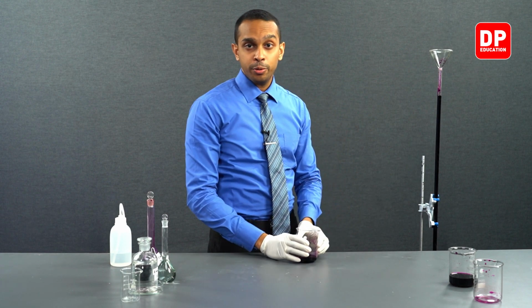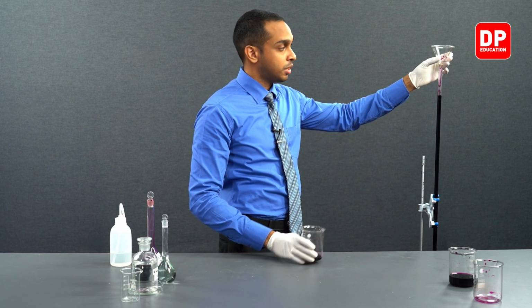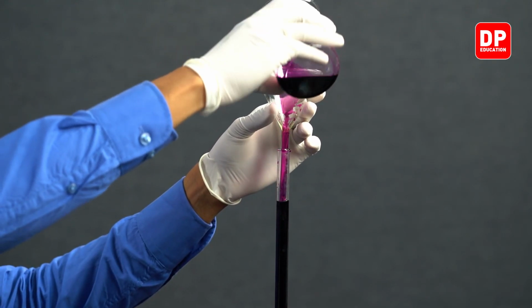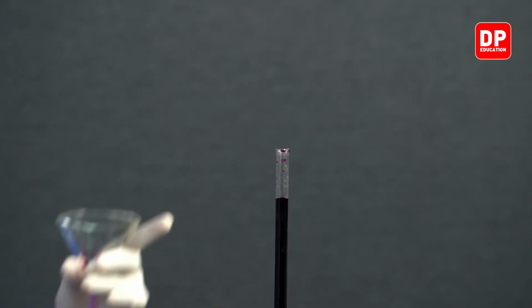When you are filling a burette, please make sure initially when you are adding the solution to add the solution over the zero line. The reason for this will be clear to you in just a second.